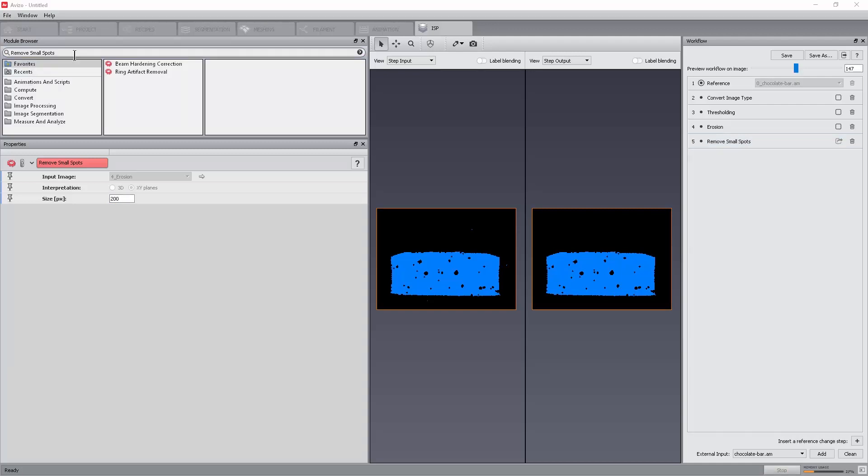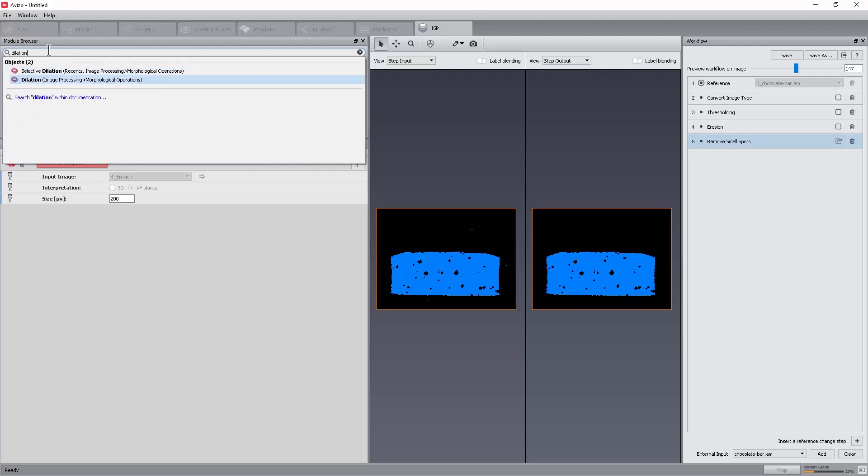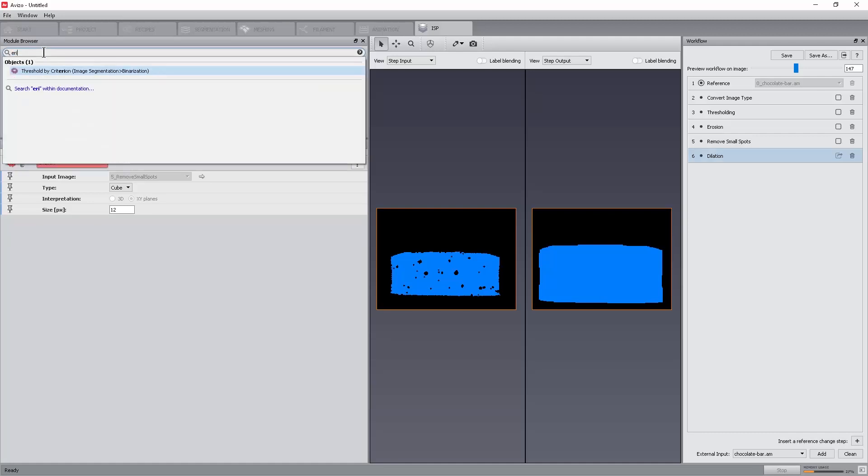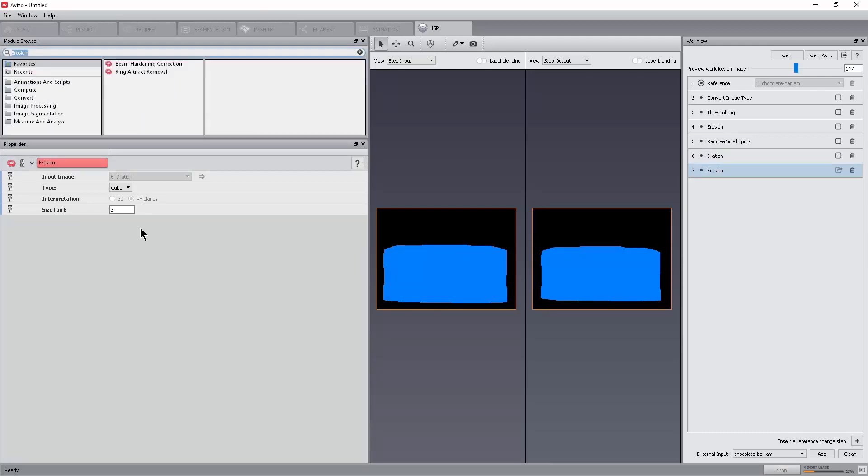A dilation to over-dilate the selection. This will fill holes and smooth boundaries. Set size to 12. Another erosion to erode selection and go back to the original data shape but without holes this time. Set size to 9.